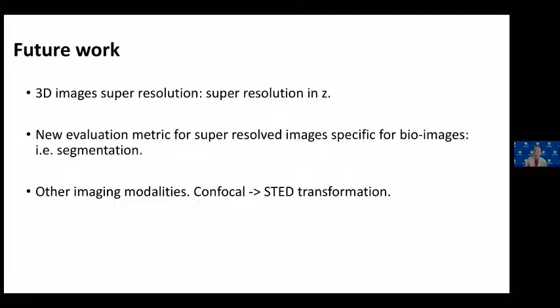For example, in the imaging field, we also have a type of imaging technique we call super resolution imaging, which people developed to break the basic physics limit of the image resolution you can get. One type of super resolution imaging is called STED, and we actually have it at our core facility. So our idea is to collect images under both confocal and STED super resolution, and try to train the model to learn how to go from a confocal image to a STED super resolution image.